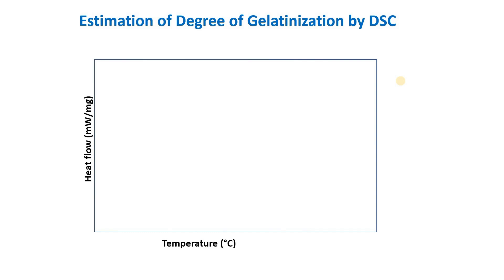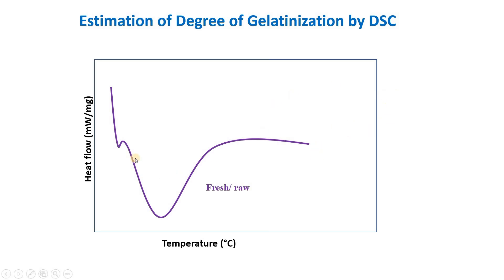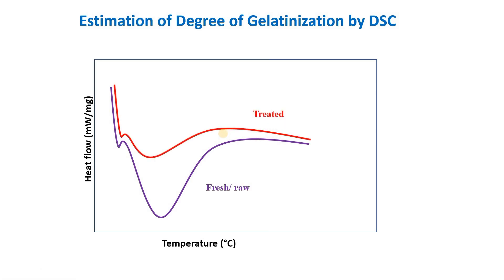For food samples containing starch, the material undergoes gelatinization, so we calculate the degree of gelatinization instead. Gelatinization is an endothermic process. In a fresh sample, starch is intact with a more crystalline structure. Gelatinization disrupts this crystalline structure. A sample with higher crystallinity gives a larger enthalpy of gelatinization, while a treated sample with reduced crystallinity gives a smaller enthalpy of gelatinization.